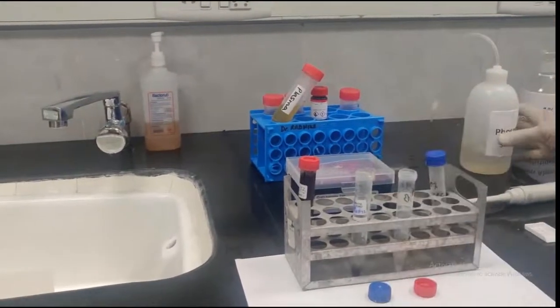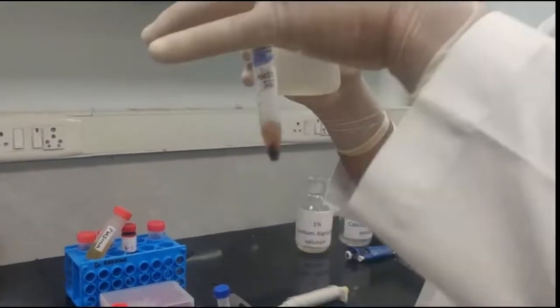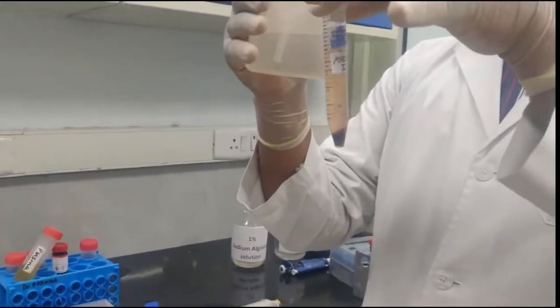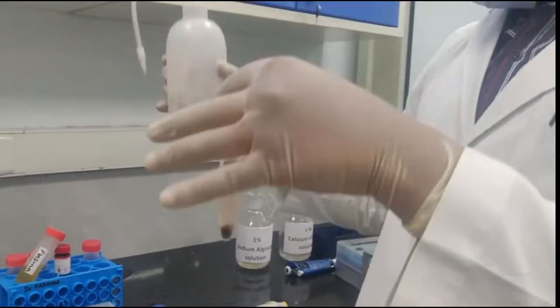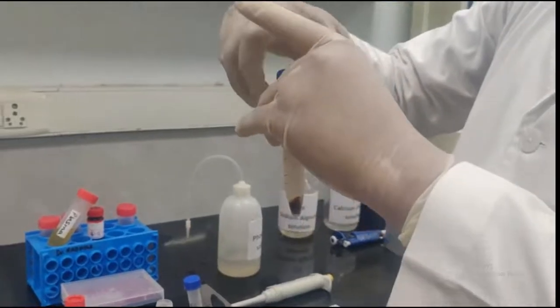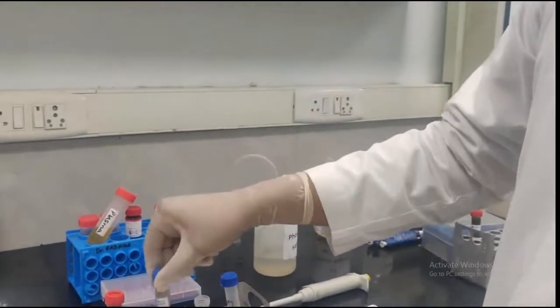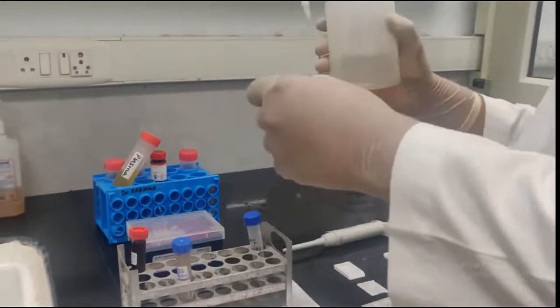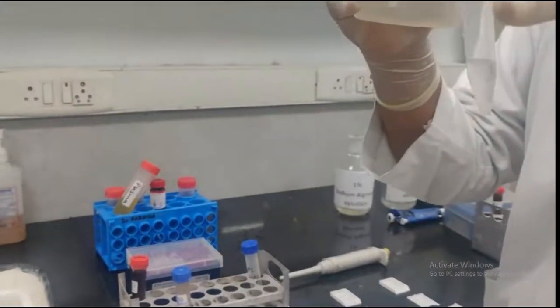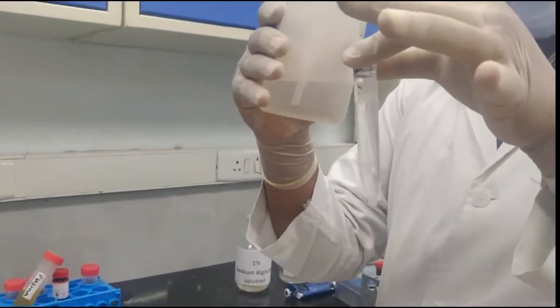Now for the third washing step, we'll again add phosphate buffered saline. We need to mix this phosphate buffered saline well with the pellet so as to ensure that a nice pellet will be formed in the next washing step. After centrifugation, a nice pellet should be formed.